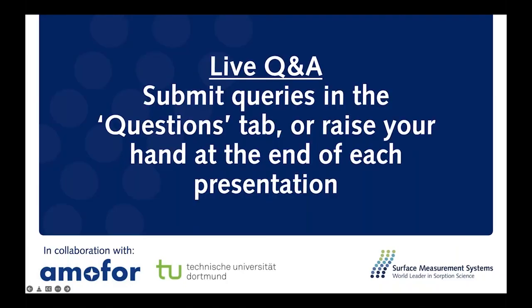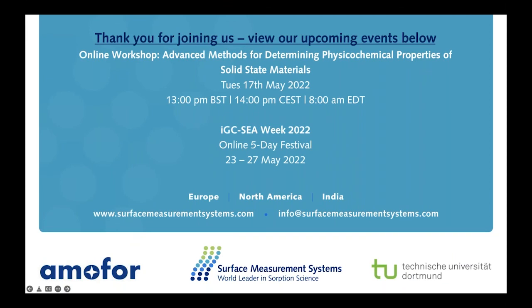So the last presentation. I'm looking at the questions. Yeah, here we get a question. Can you detect multiple Tgs, glass transitions, in a single sample?